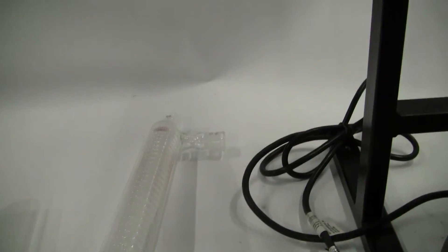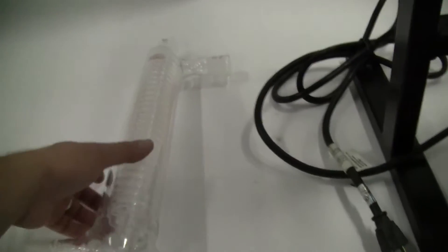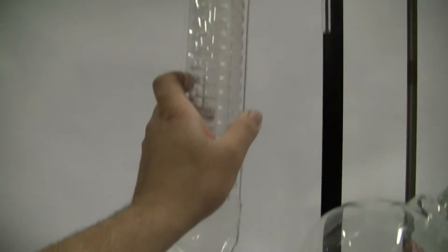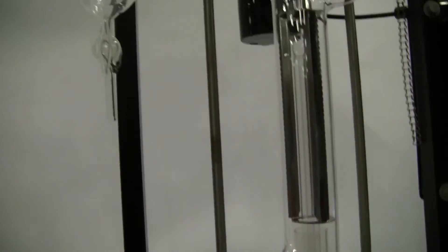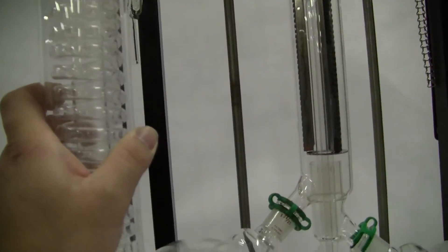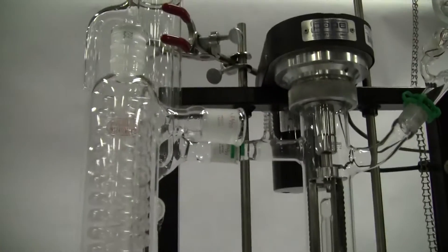It also has a separate column that you'll need to buy a glass adapter for, if necessary, which would go in this spot over here and hang down on the adapters. Because if you put it there, it would obviously hit the glassware, so you have to buy an extender and have it come out.